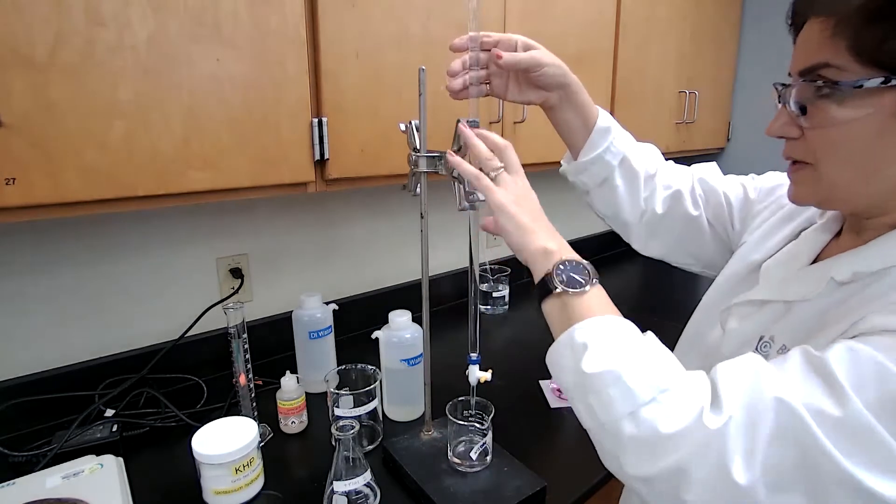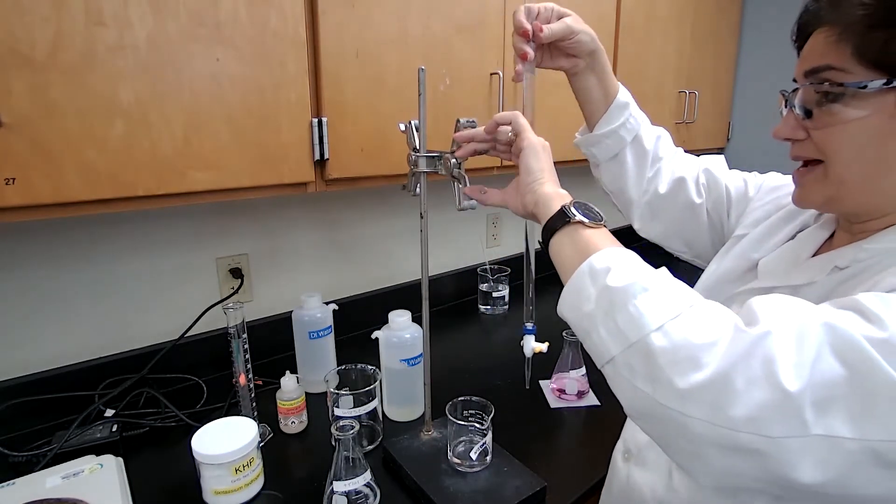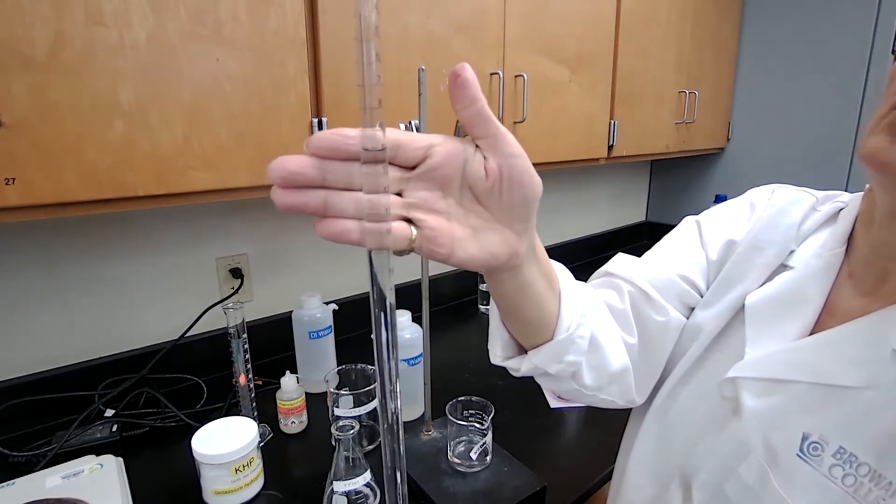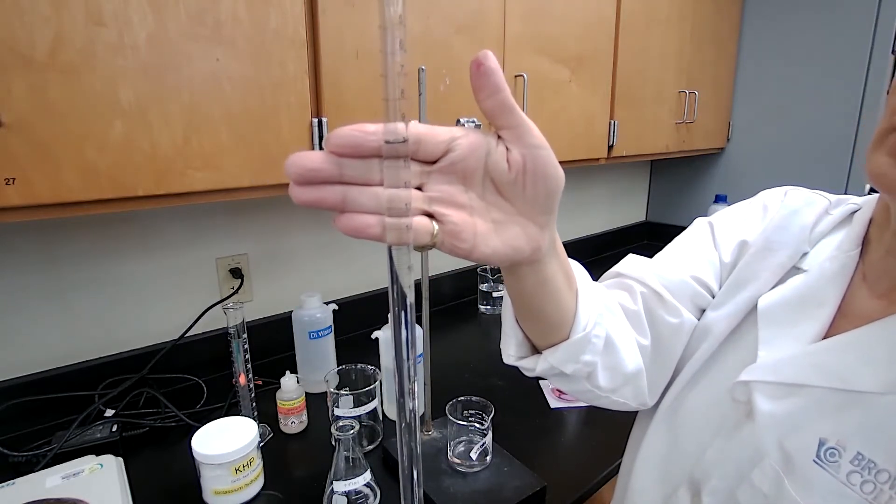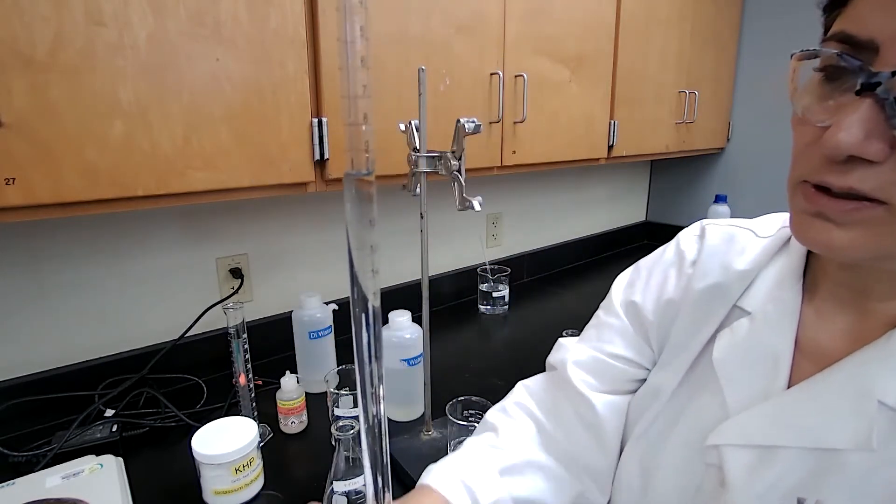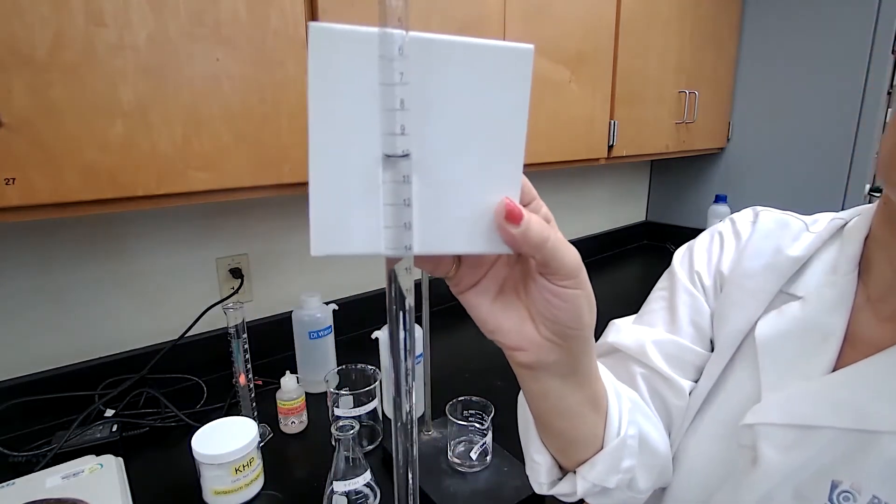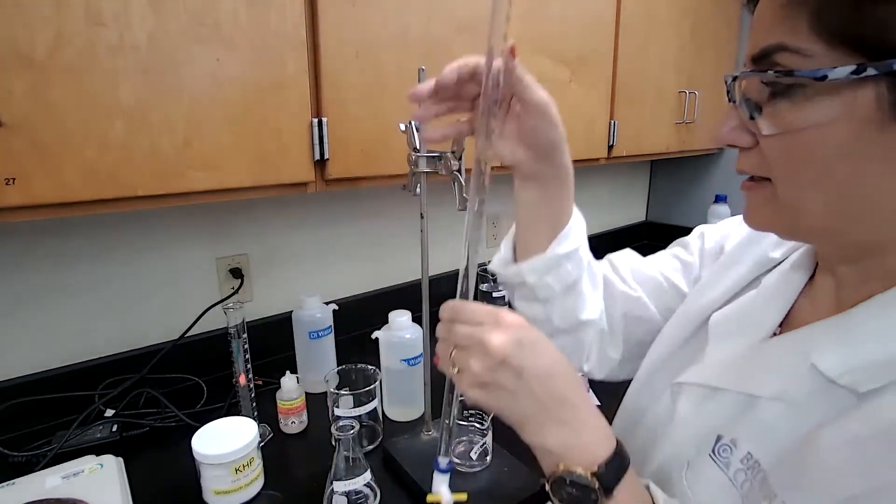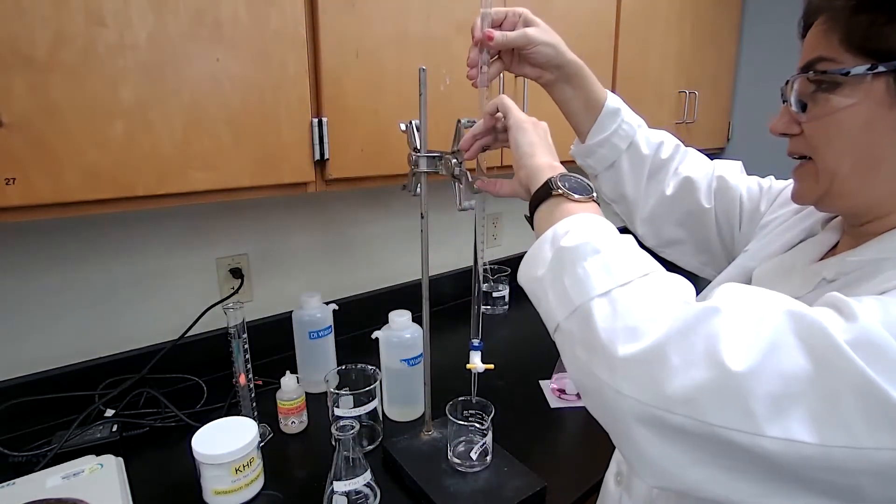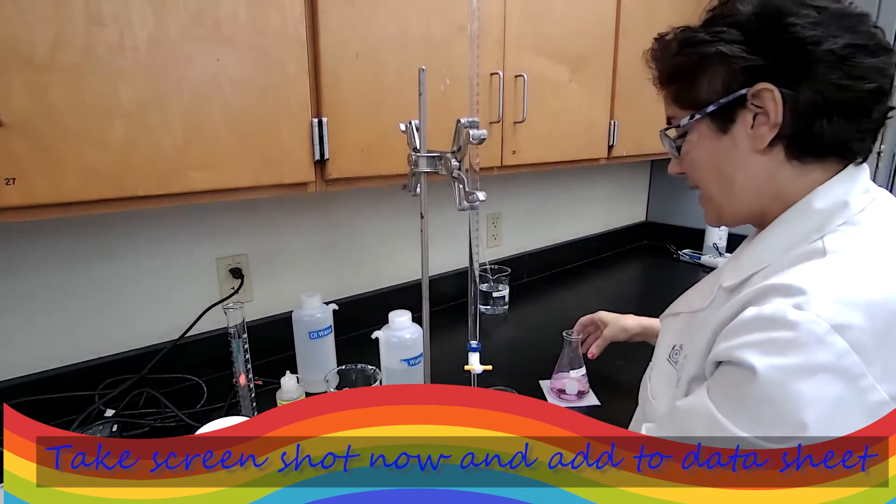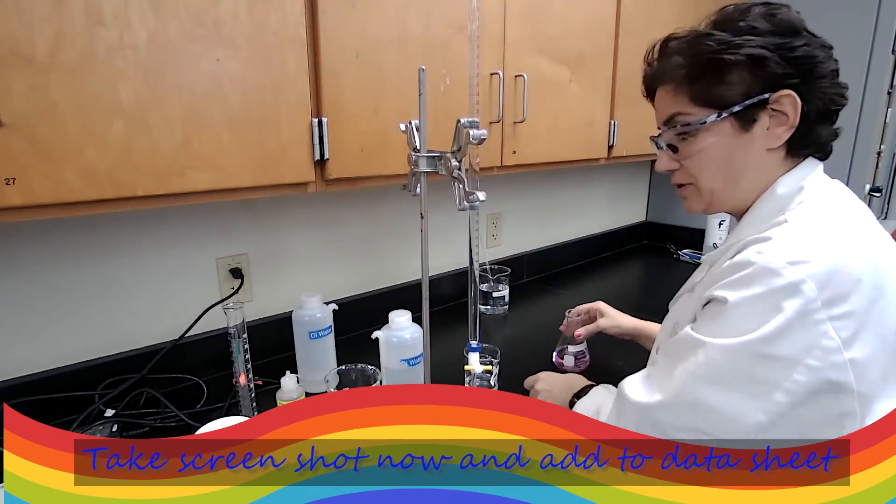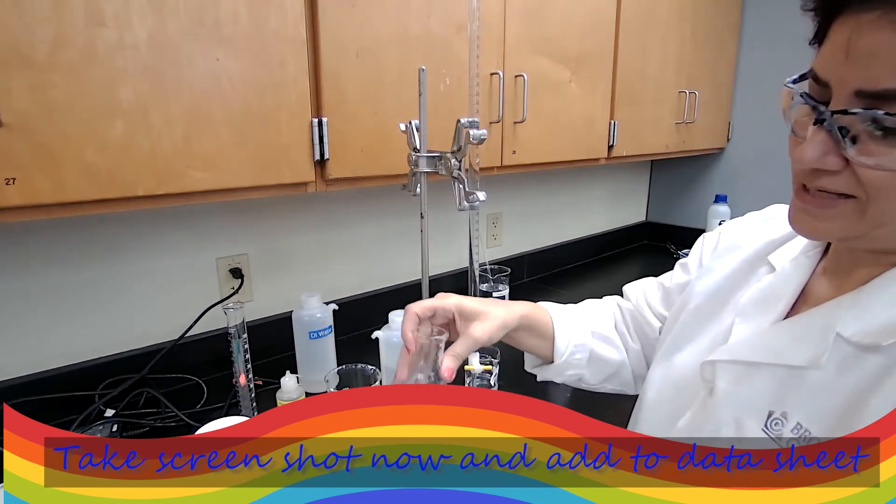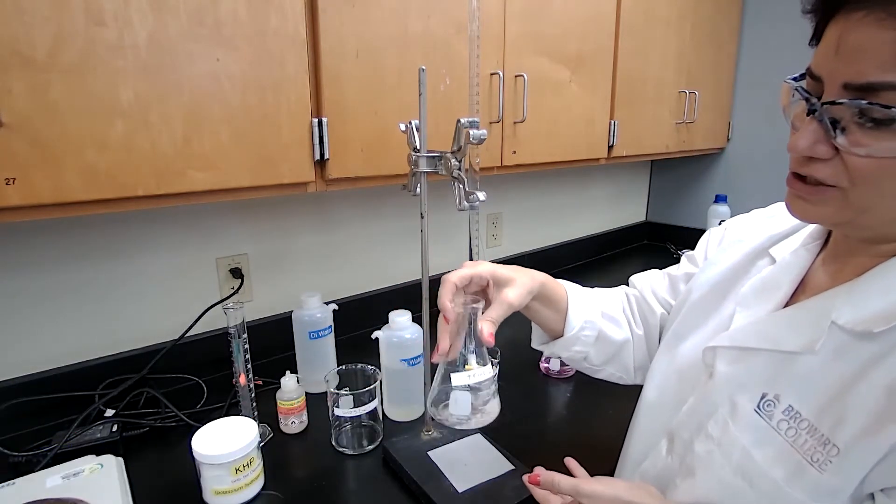Record this volume as initial. So that is the initial burette reading for trial two. That is your second trial. Initial burette reading 10.00 for trial two. And I'm going to start with the titration of the second sample of KHP.